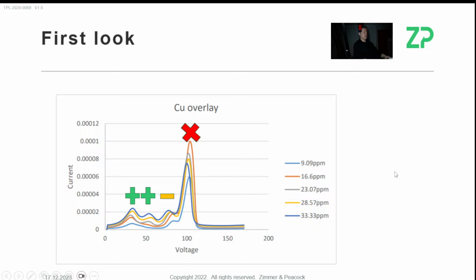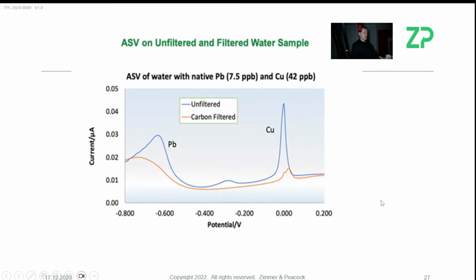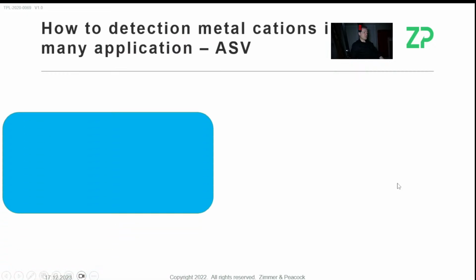I will explain what I think is going on here, and the clue is in your email, where you said you're using ammonium acetate. I have a suspicion that is the clue to this. This is quite nice because we've done our own work on this. We're doing the analysis of lead and copper. We have a nice clean copper peak, and we don't have peaks either above or below it the way that you're reporting. In this case we're using something much more native, more like tap water. So we're definitely not adding ammonium acetate, which I think is your material.